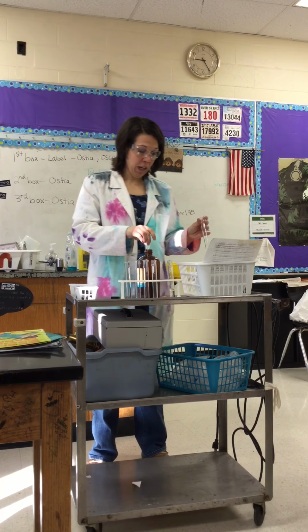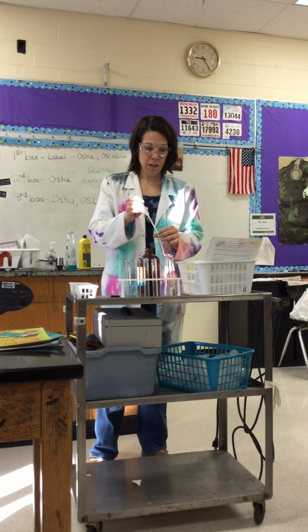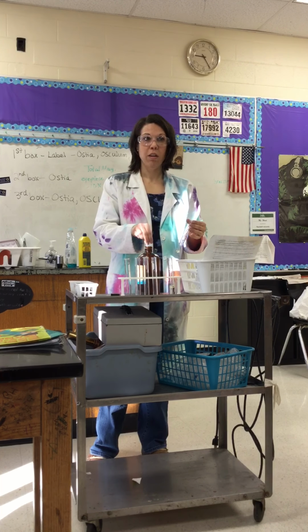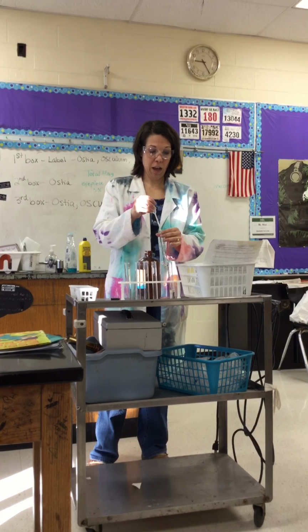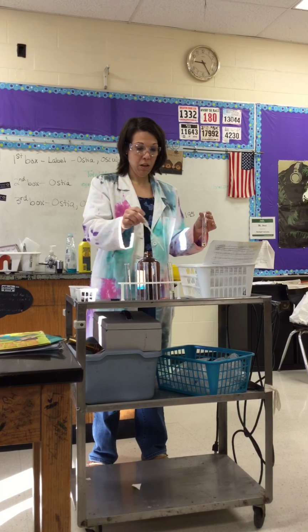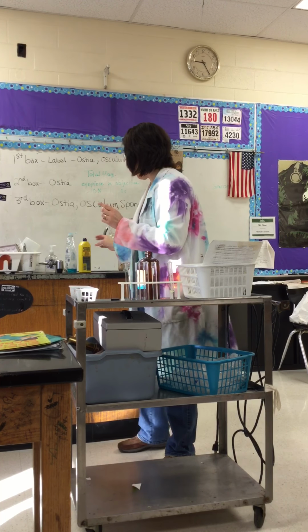You can try another solubility test too, because what's the rule of solubility? What did I tell you that rule was? You wrote it down on your paper yesterday. Like dissolves like. Remember that. The rule of solubility is like dissolves like.